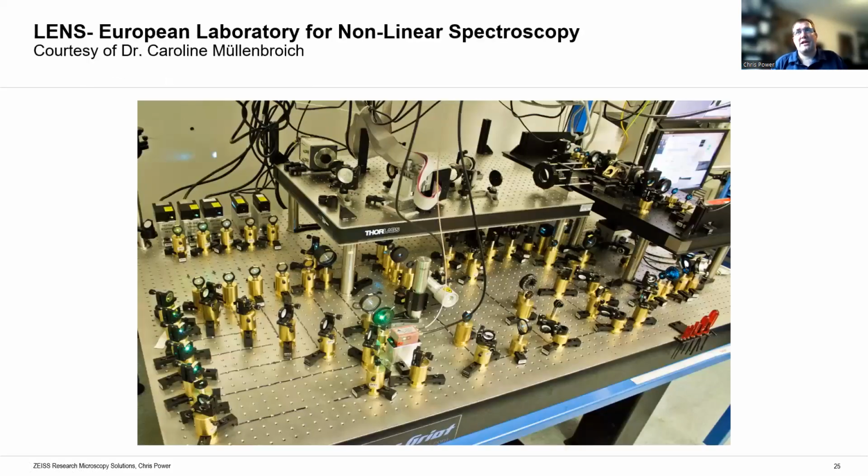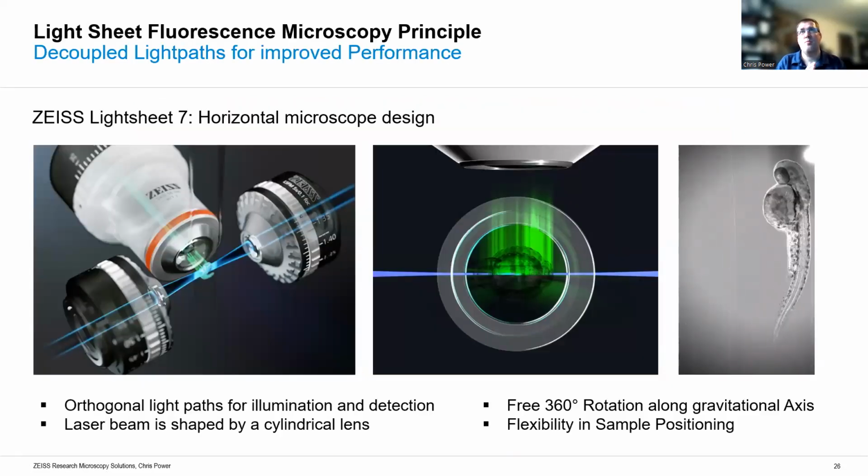Now, just to carry along the evolution, after the 2004 paper, people were doing all kinds of optical benches to try and get this system made. And we were looking at different architectures and ways that we could build this microscope, and different designs. We eventually went for this kind of setup where you have a detection lens at the back and you have excitation lenses from the side.